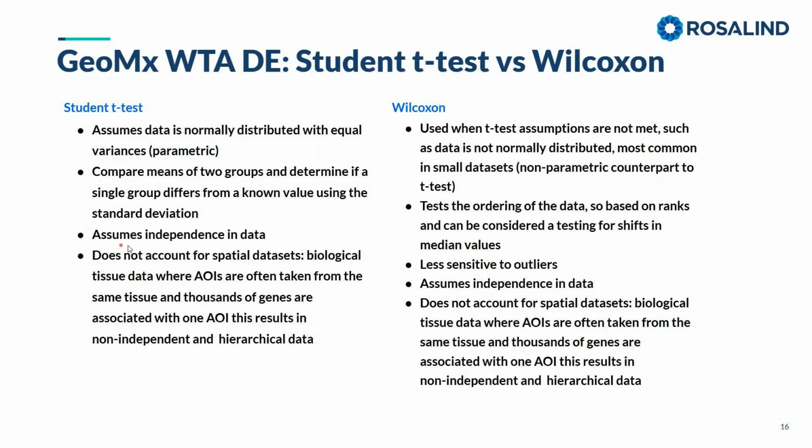However, both of these tests assume independence in data. So that means that neither of these best fit the spatial data sets that we discussed. We're working with biological tissue where you have multiple AOIs taken from the same tissue, and you also have thousands of genes associated with one AOI, and not one data point for one sample.